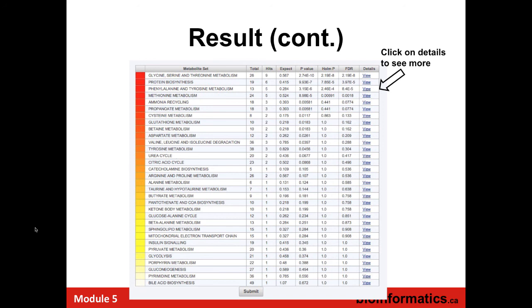This is where I think there's obviously lots of debate. 0.05 is something that was never actually suggested. It just sort of became a standard, and people will die on a sword if someone's at 0.06 or 0.04. And it's silly. But if you want to use 0.25, fine. And all you need to do, if you're explaining it, is simply say, based on how other people have done it, this is how I've chosen to do it.